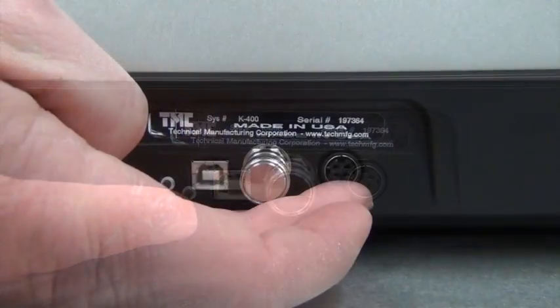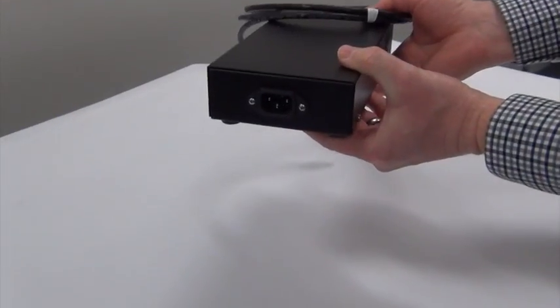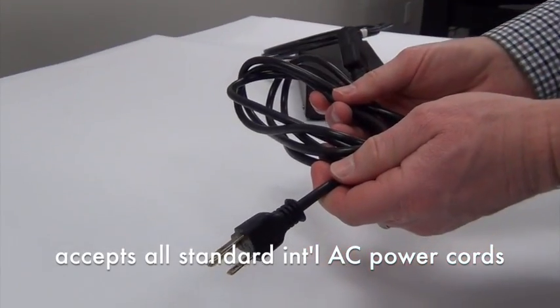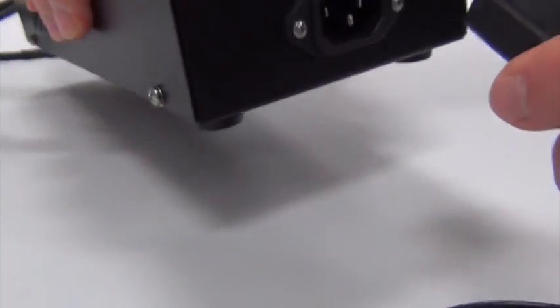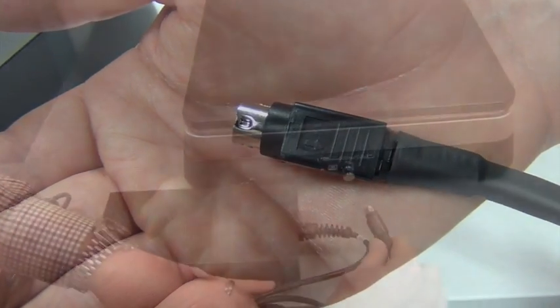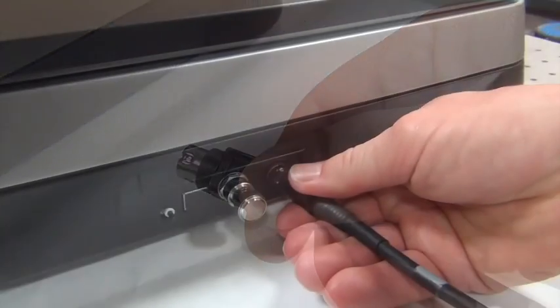And finally, the input for the external power supply. The universal power supply provided is designed to accept all standard international AC power cords. Simply plug the supplied power cord into the back of the power supply provided, then connect the power supply to the back of the K400, checking to be sure the connector is aligned properly.